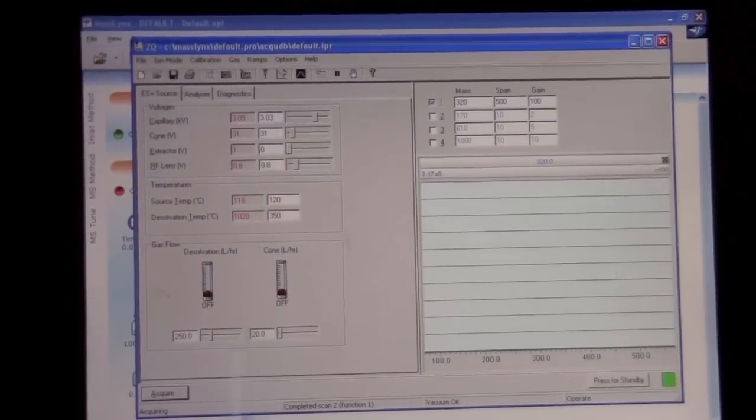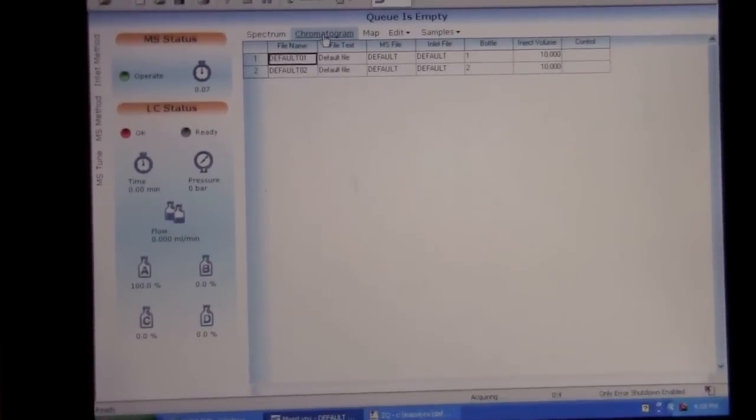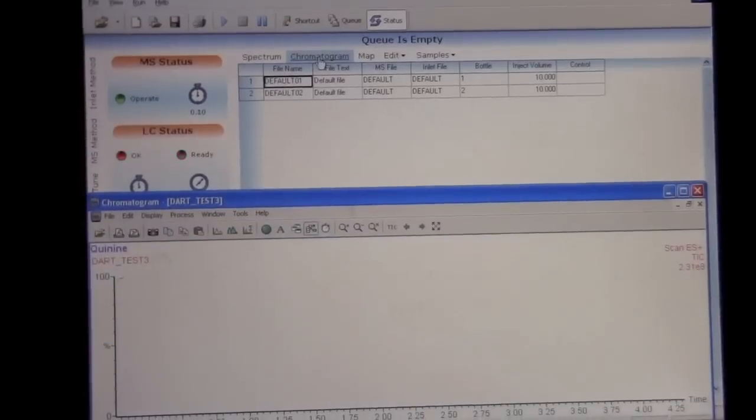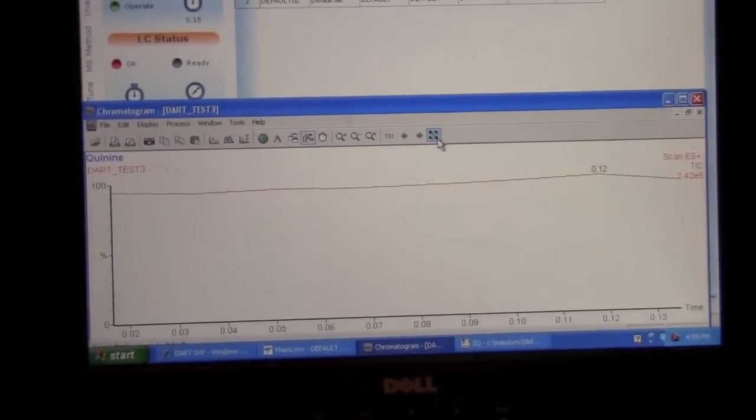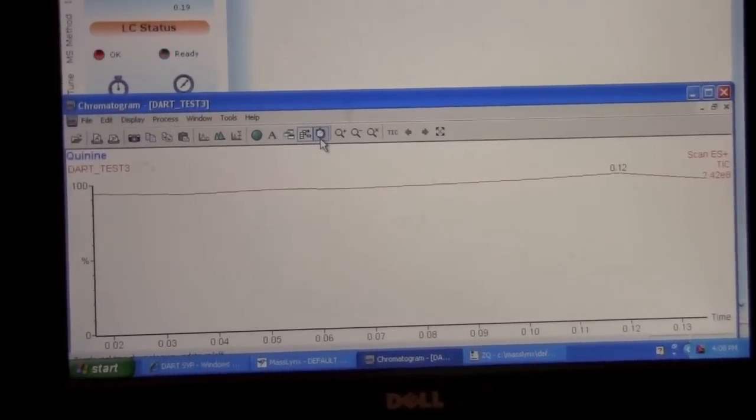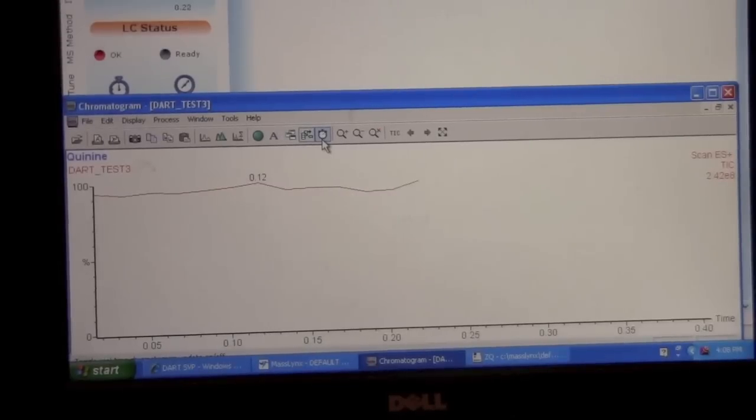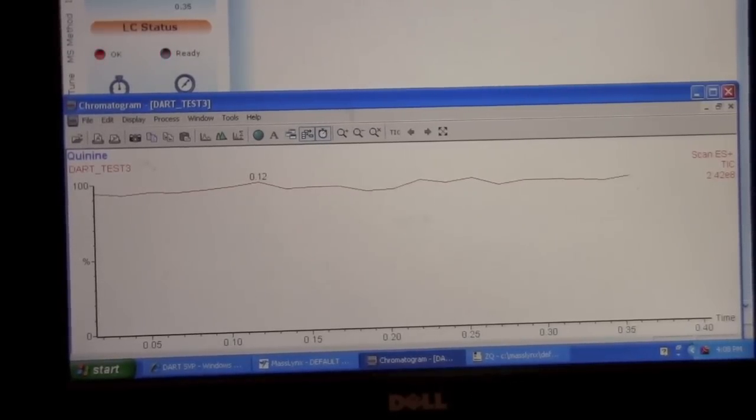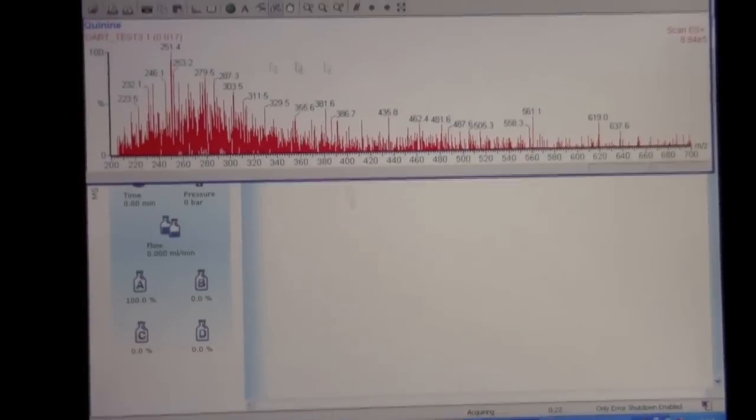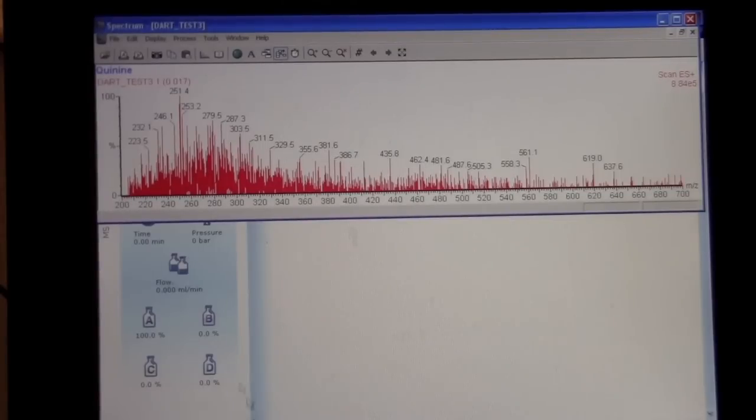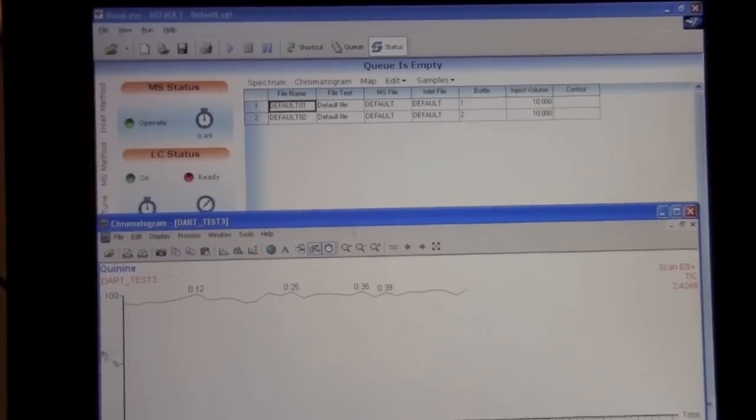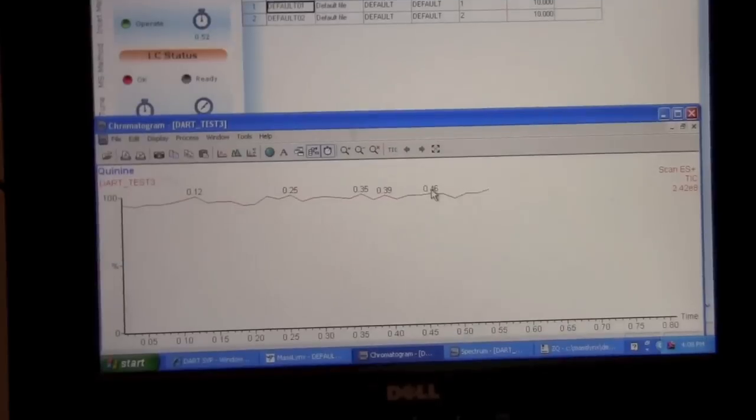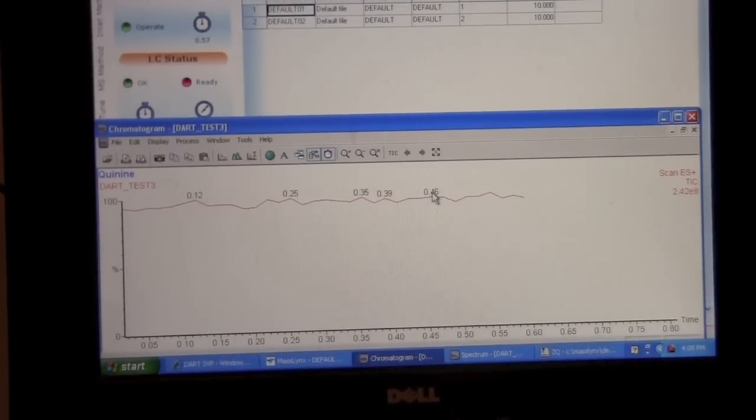So we want to go back to the main page here and look at the chromatogram. We may want to expand to the full range and turn on the real time update. So this is an update of the ions coming into the mass spectrometer, the total ion count. We can also bring up a spectrum which we'll use later to see the data that we're collecting.